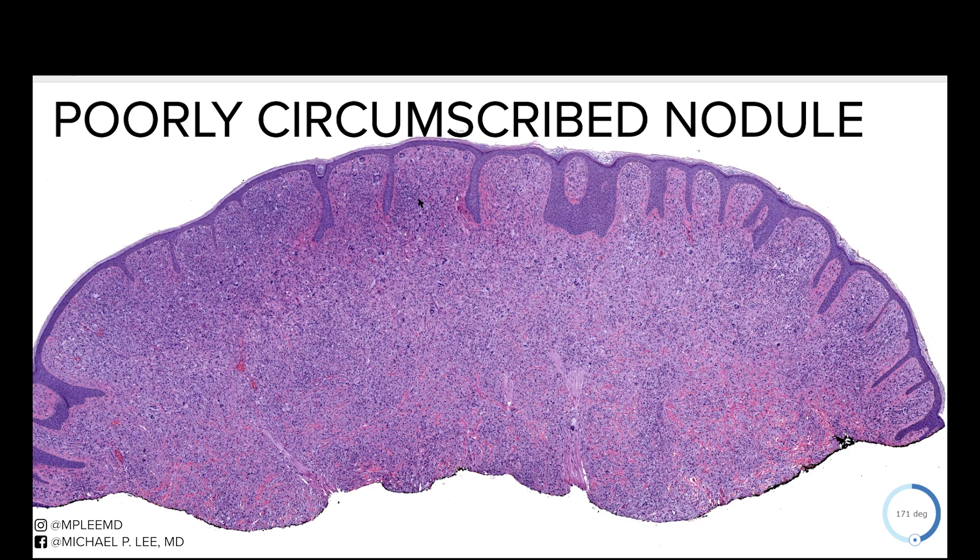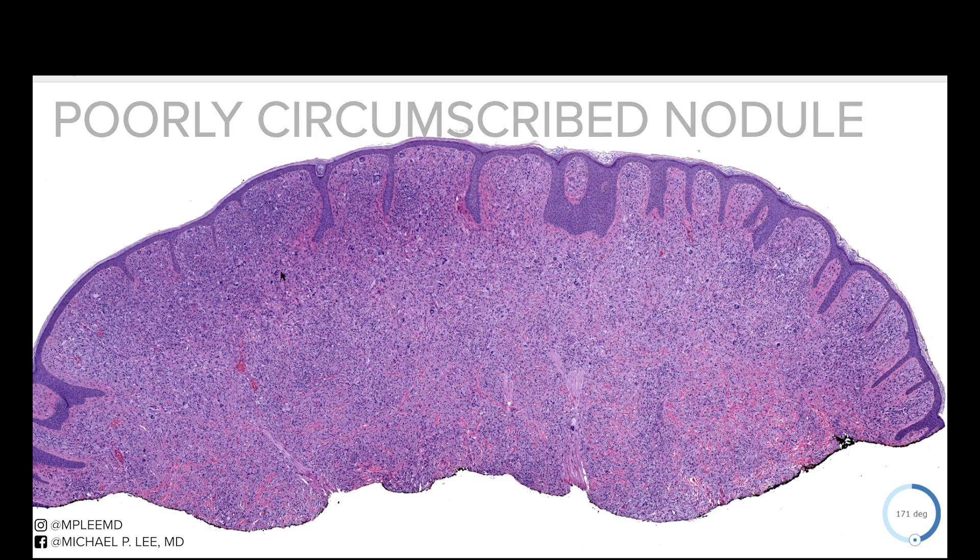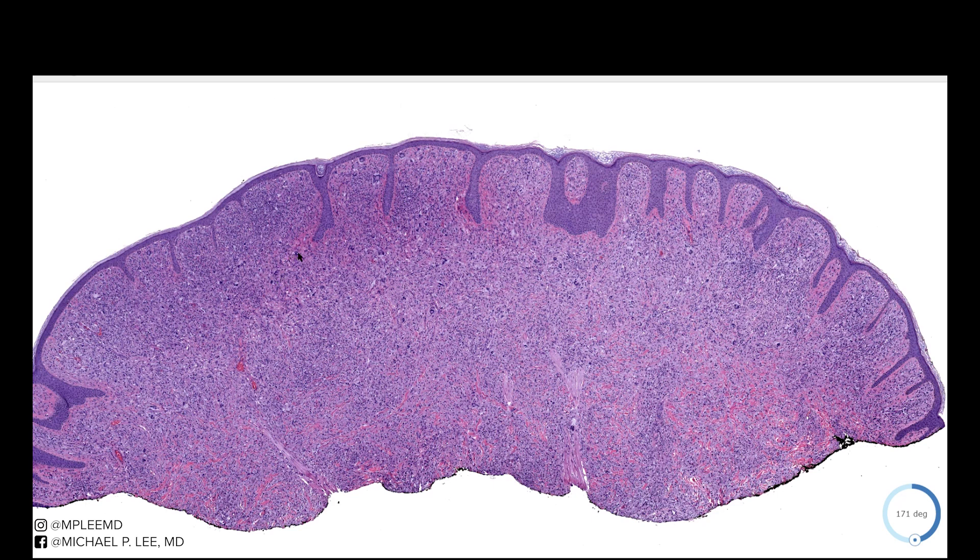As we look around this slide, out in this corner here you have some darker bluer cells, and then scattered in between you see these even larger cells that look a little bit darker. Then you have some larger cells here that have sort of this pale rim around them, and as we go further down there's more of this pale material. We're going to take a higher power look at what all this is.